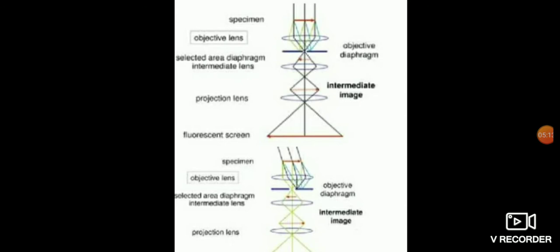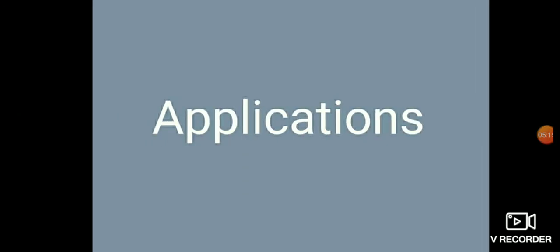Okay. Now the application part. A transmission electron microscope is ideal for a number of different fields such as life sciences, nanotechnology, medical, biological, and material research, forensic analysis, gemology, and metallurgy, as well as industry and education. TEMs provide topographical, morphological, compositional, and crystalline information.